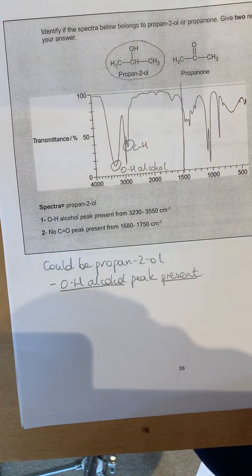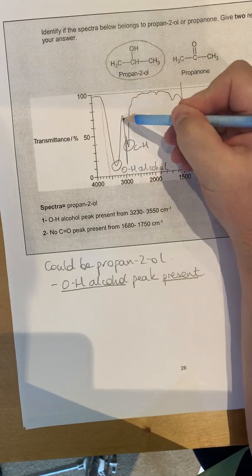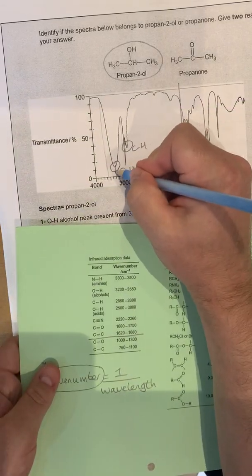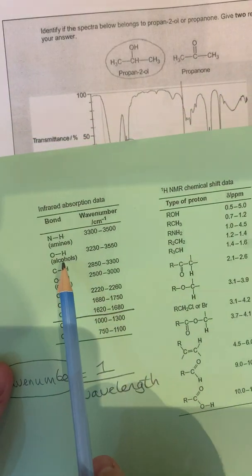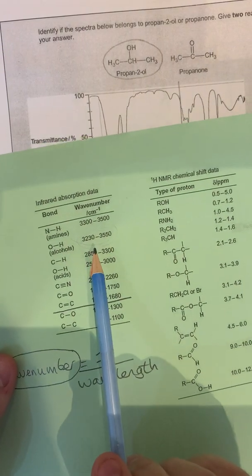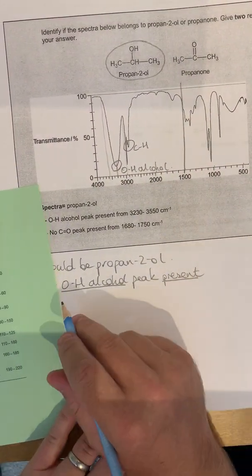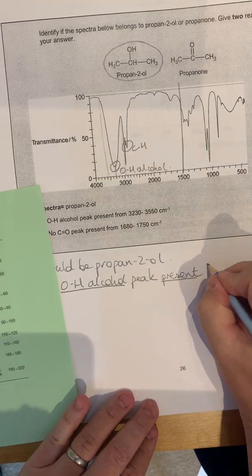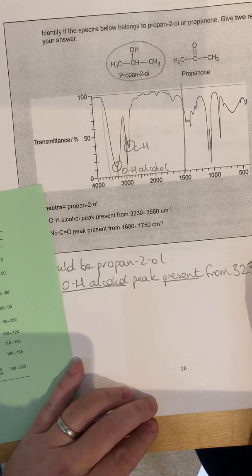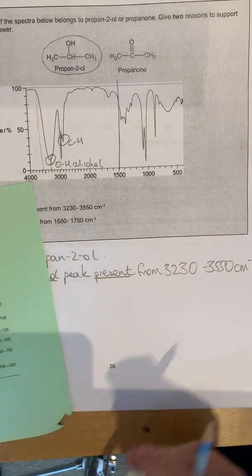Now you always state the wave numbers, not from here where you're sort of going from there to there, don't do that. Or even looking at the central point down there, always take it off that. You've identified that that's an O to H alcohol, you copy the numbers down off there. And an O to H alcohol absorbs from 3230 to 3550. So an O to H alcohol peak present from 3230 to 3550 centimetres to the -1.